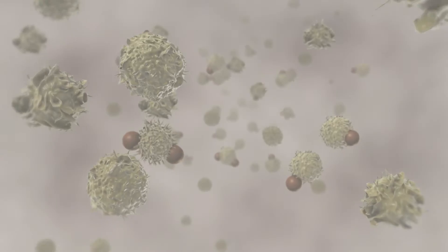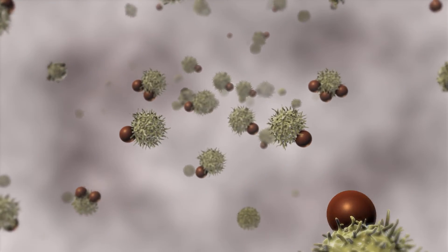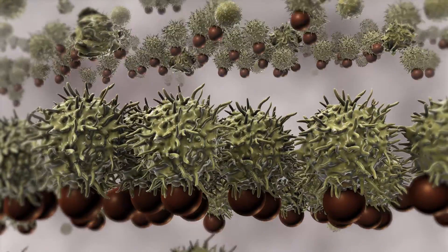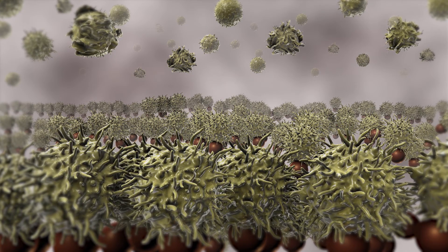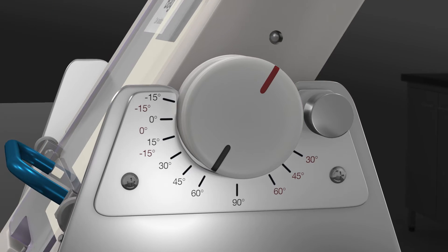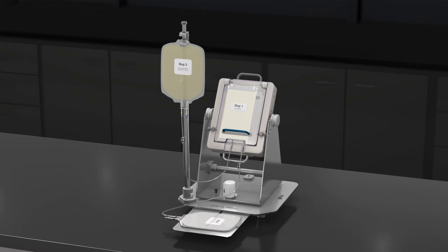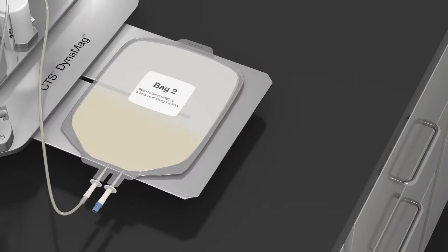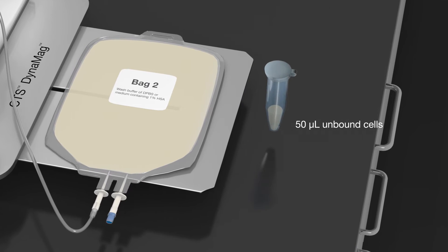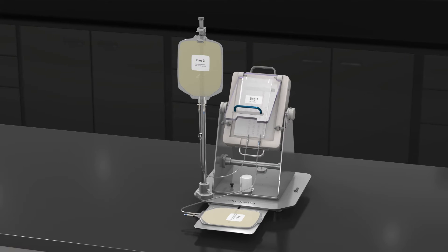Once bag 1 is placed onto the CTS DynaMag magnet, T cells bound to the CTS DynaBeads CD3, CD28 magnetic beads are pulled towards the magnet and immobilized. Unbound cells can be removed to leave pure, viable, and functional T cells behind. Set the primary magnet operating angle to 60 degrees and drain the unbound cells from bag 1 into the now empty bag 2. Remove 50 microliters from the unbound cells in bag 2 for the calculation of isolation efficiency later, then remove bag 1 from the primary magnet.